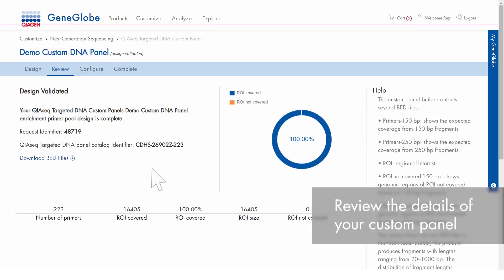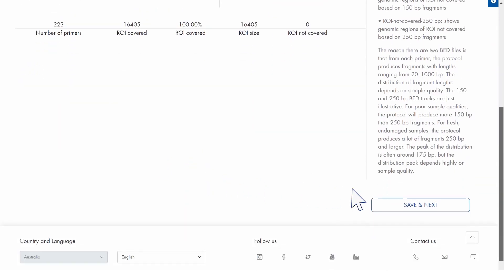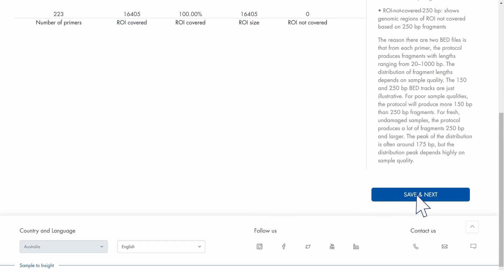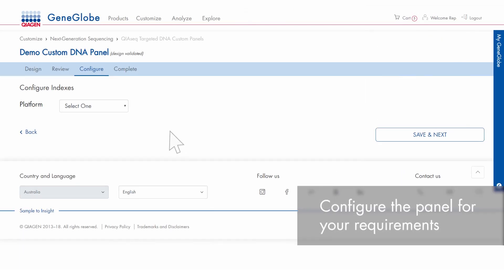Review the specific details of your custom panel and access the corresponding bed files. Click Save and Next to configure the panel for your requirements.